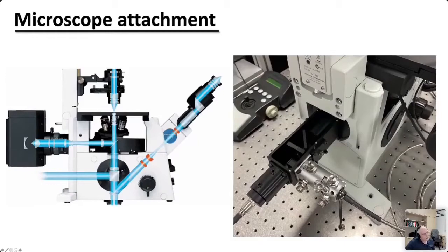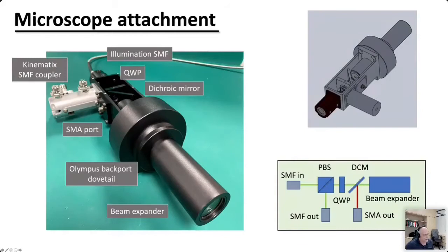What we do is stick our designed attachment to the back of the microscope, using the port which is normally there for camera coordination. The light is launched from a single mode fiber. You'll notice this picture was taken before the optical components are in, so there is a beam splitter missing at the moment. This one here is a kinematic Kineflex fiber coupler which acts as a single mode fiber with a pinhole.